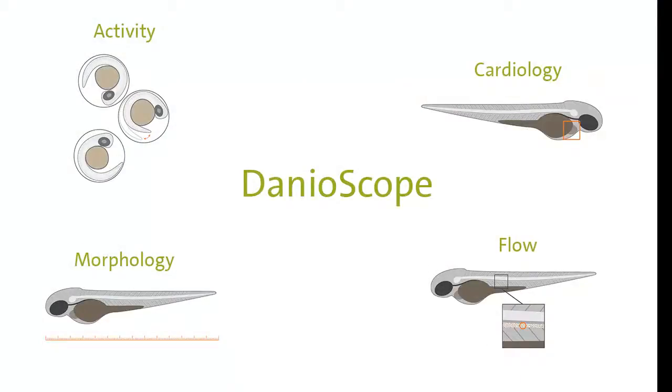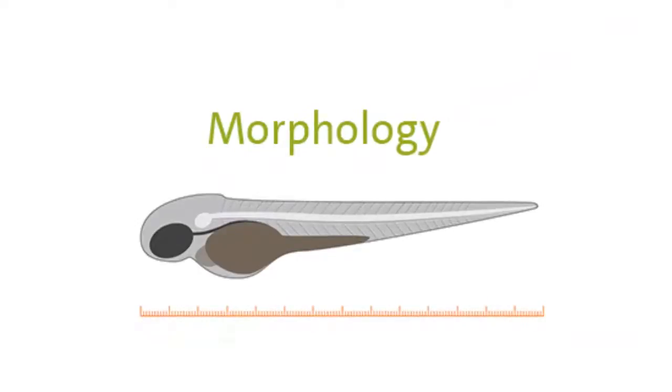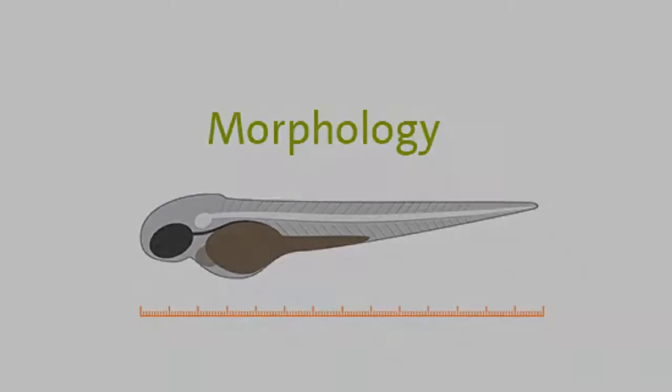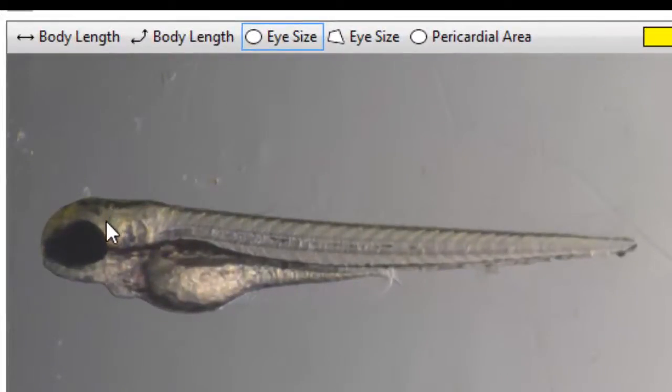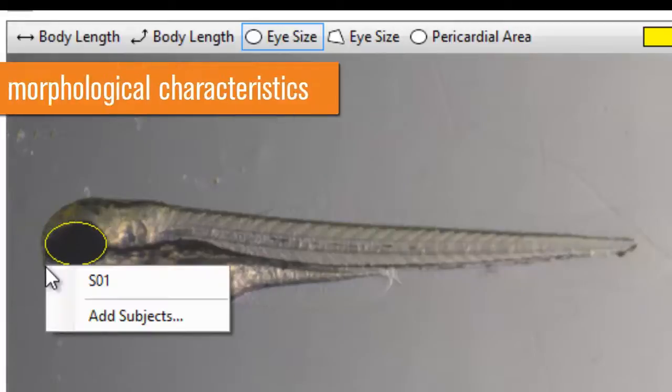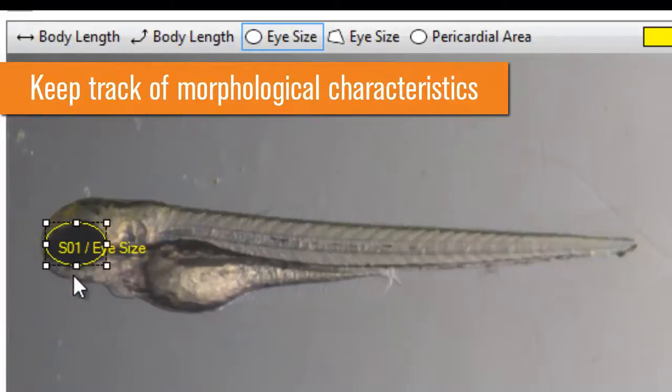DanioScope also includes a tool to keep track of morphological characteristics. After calibration, you can measure eye size, body length, or any other parameter that you're interested in.